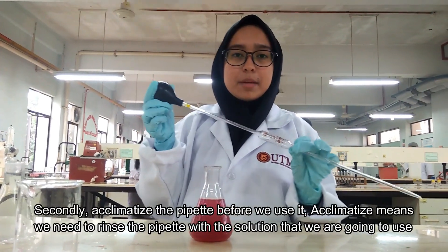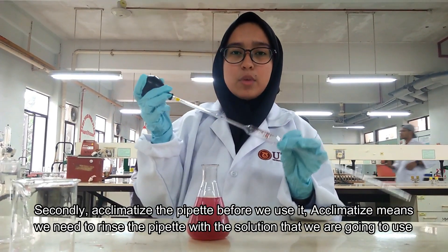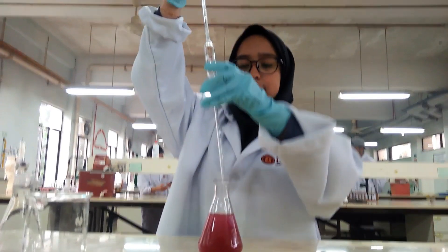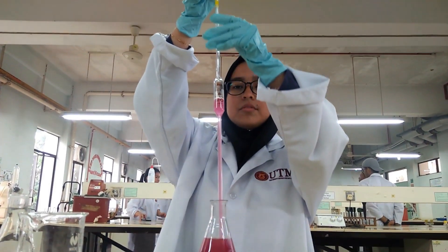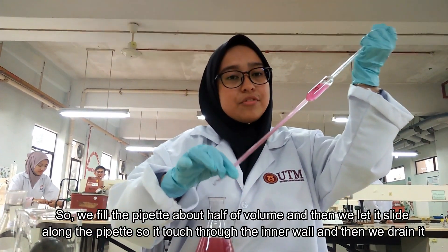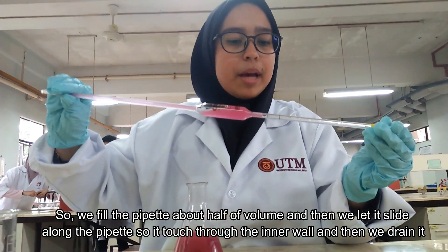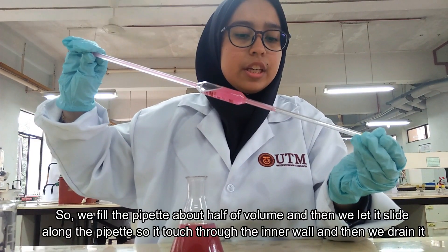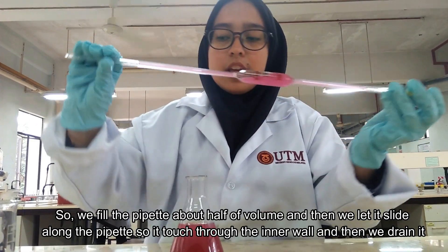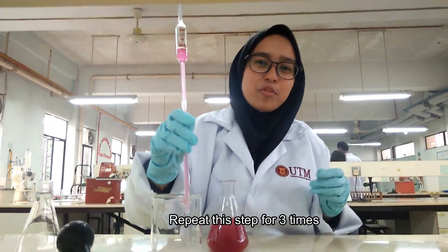We need to acclimatize the pipette before we use it. Acclimatize means we need to rinse the pipette with the solution that we are going to use. We fill the pipette about half the volume and then let it slide along the pipette so that it touches the inner wall. Then we drain it. Repeat this step three times.